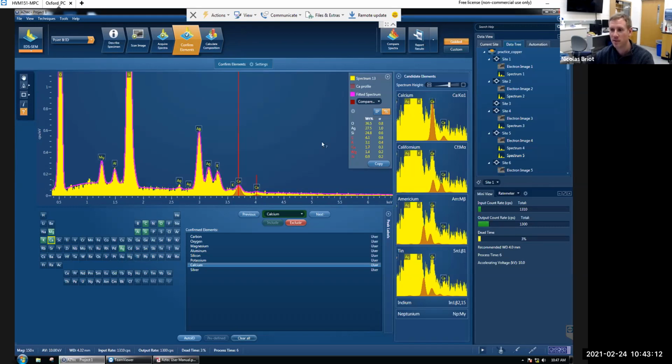I mean, you know that because that rod is yellow, right? I mean, it changed colors, something happened to it. So why we couldn't see it on the cross section? I mean, right now we are probing. I mean, again, at 10 kilovolts, that's what I'm using.